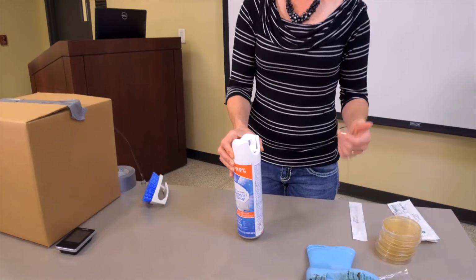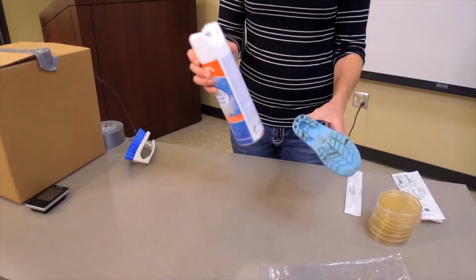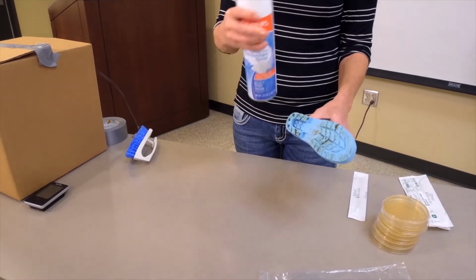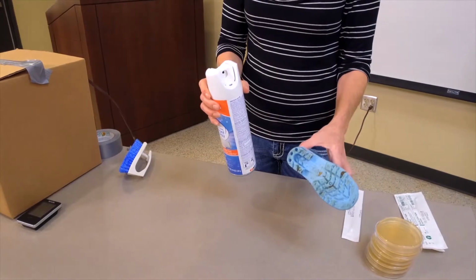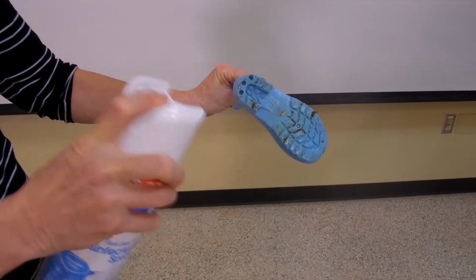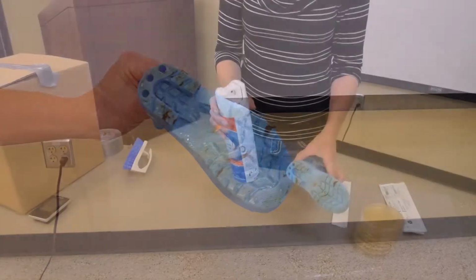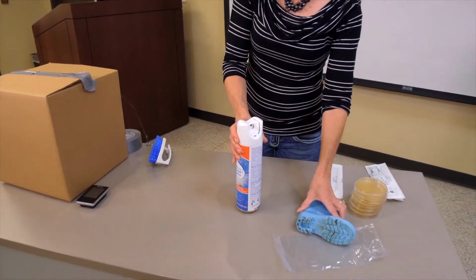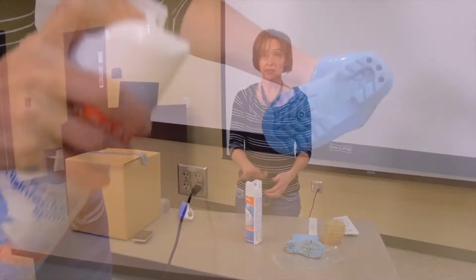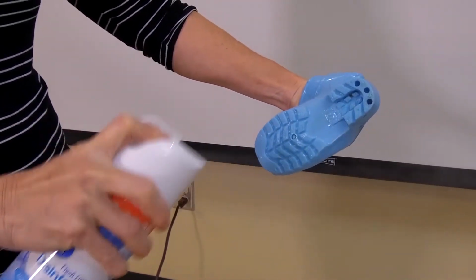So commonly, people will have sort of a false sense of security that just applying disinfectant alone will kill all the pathogens. However, if the organic material is still present, that's a rather ineffective technique. So just spraying a dirty boot with disinfectant is not going to kill your bacteria. And then finally, we'll have some students plate the boots after they've been cleaned properly and then following the manufacturer's guidelines on proper use of the disinfectant.